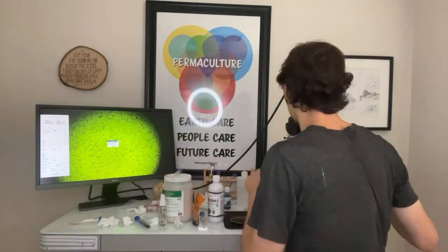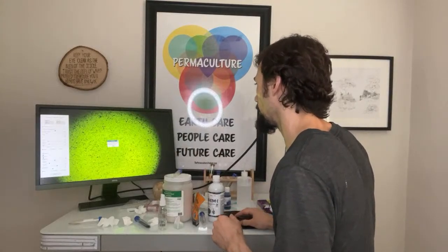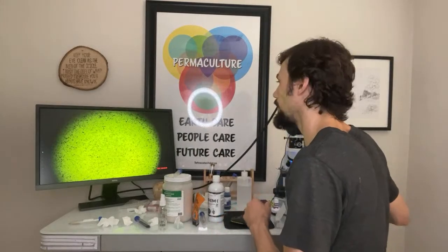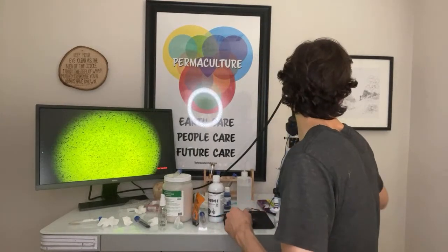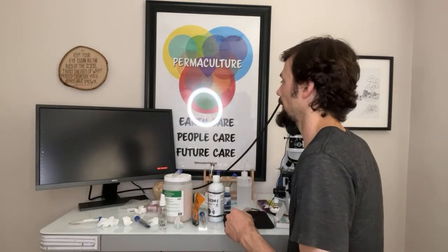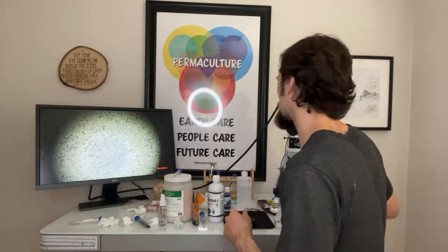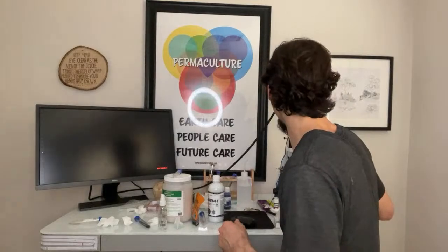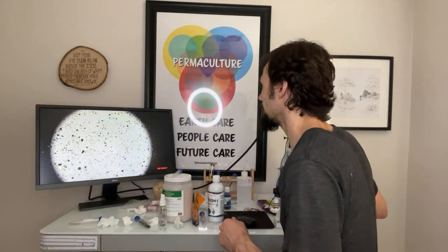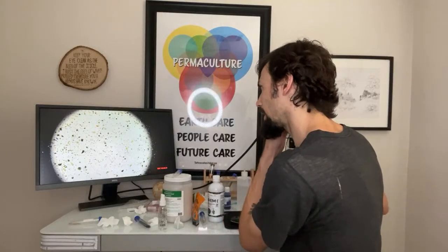All right, so I have to reset the video, there we go. All right, so we're here, we zoomed out. Let's actually go back to bright field. Turn the base back on. All right, so this looks a lot like, actually, there's some other minerals that are closer to the compost.